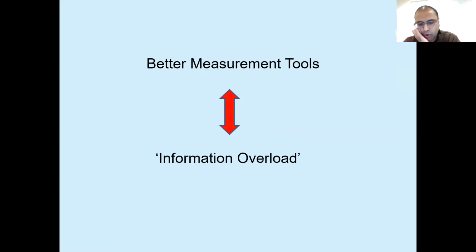So I guess the moral of the story here is you should think carefully if it actually makes sense to use one of these fancy microscopes. Can you get the job done with a confocal or an Airyscan microscope? Or do you actually have to use these fancier microscopes? That's something you have to think about depending on what biology you're studying. But it really can be a challenge when you have these massive data sets.